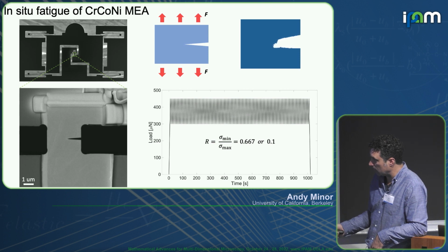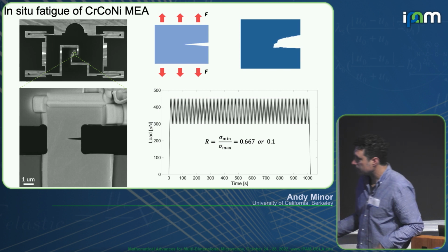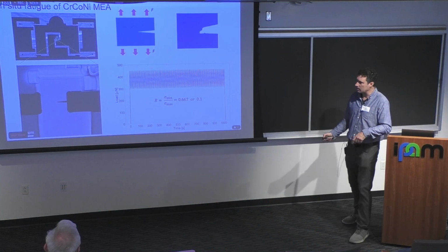So here's a metal foil, the jet polished medium entropy alloy foil, where we pulled it out with a FIB, only FIBbed the sides, and we FIBbed in a little crack. You know exactly where the deformation is going to start. What is the scale bar because it's covered? Yeah, good question. This gap is a couple microns. So that's 1 micron, that thing.